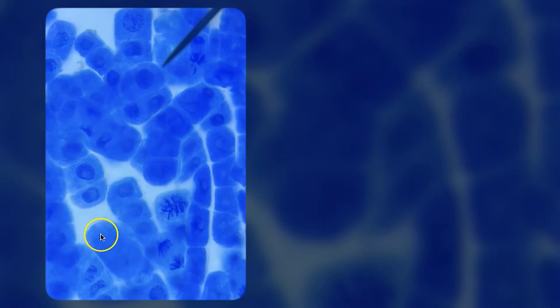So here you can see clearly the cells and the different stages of mitosis. This is the sort of thing that hopefully the students are able to find. Now it's always good to have a backup in case yours doesn't work. I'm actually using here a slide that my teacher friend Mrs. Egan managed to get really good results for.